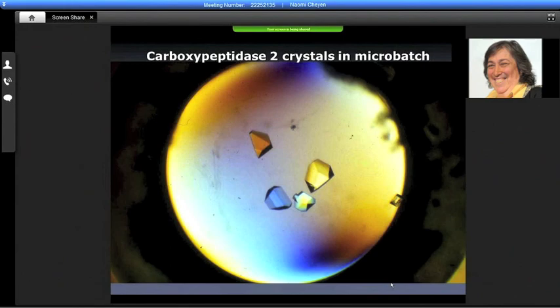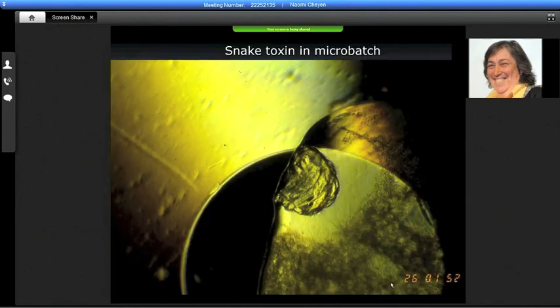And then eventually, because of cryoprotection, people wanted to do it with glycerol and decided to try vapor diffusion again, adding glycerol, and that was okay. So it worked. We went from vapor diffusion to microbatch, and then back to vapor diffusion. But you could get it if you didn't necessarily need the cryo. You could just take them from these beautiful crystals which grew in the microbatch. So that's one scenario where one switched, and that was important.